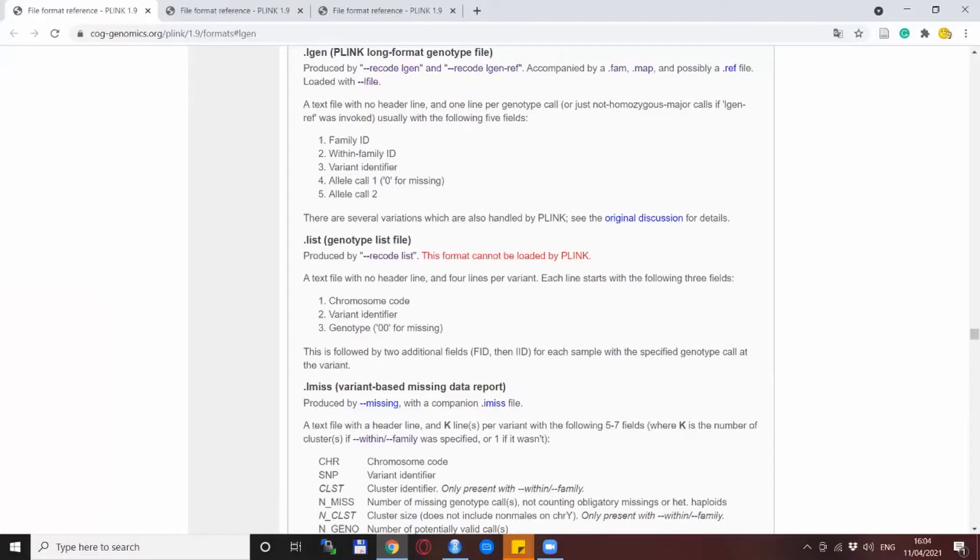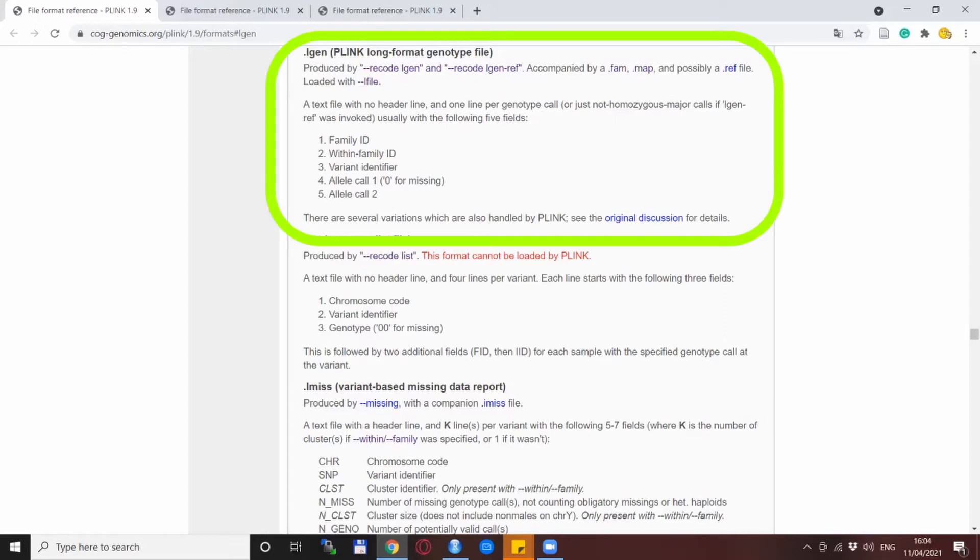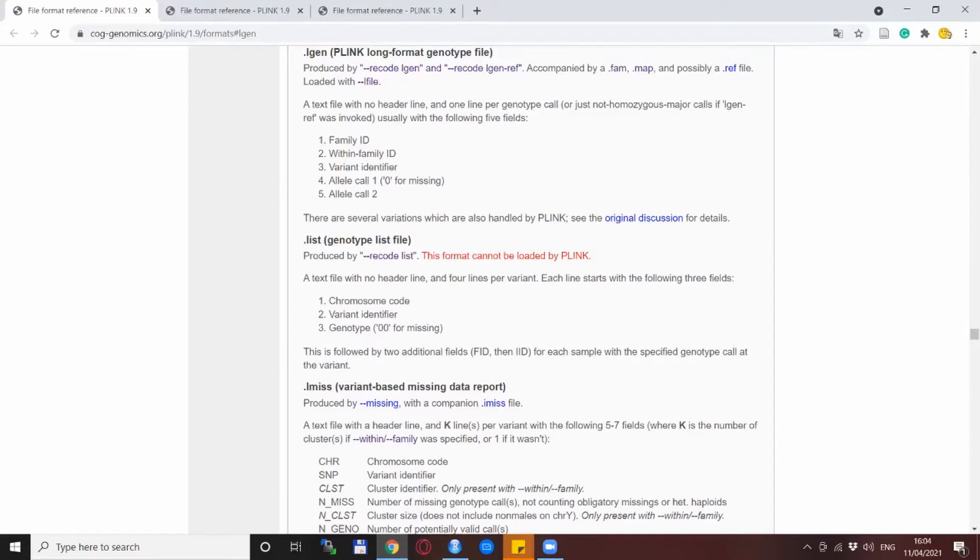So our plan is very simple. The final report itself is one line for one SNP for one individual and this is already very close to the PLINK format which is called the LGEN file. Here each line has five columns. First one is the family ID, second one is the individual ID or the within family ID, third one is the SNP name and the fourth and the fifth are basically the two alleles of the SNP.